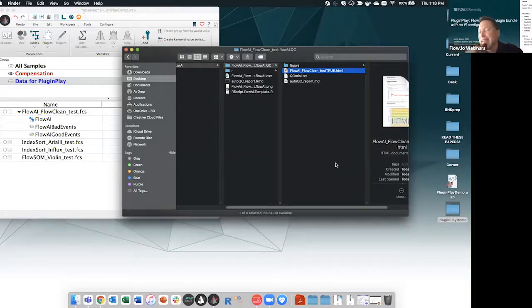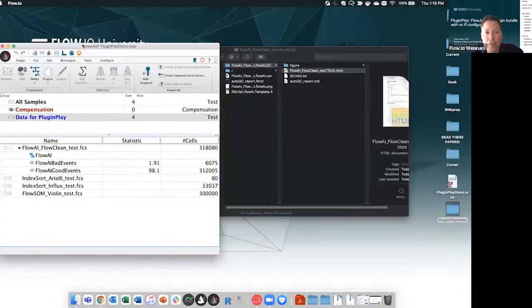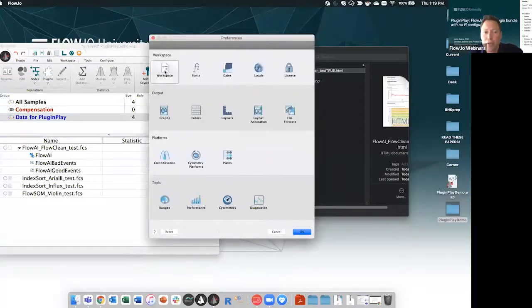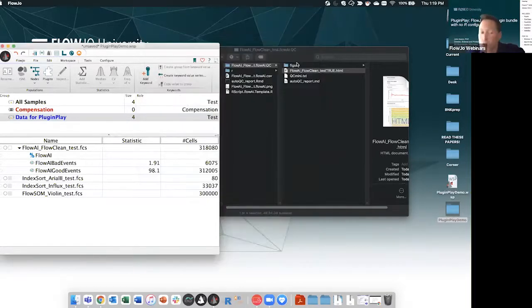If you have the exact same file name, then I suppose it would look the same. And so I'll suggest in FlowJo, you can use basically any keyword as the file name. It's just done by using the heart up here, workspace. You could also use keyword combos. So if you have, let's say, A1, A2, A3, which are going to be pretty consistent, you could add in the date as one of the keywords that get used as part of the name, and thus create a unique name that will allow you to separate and then sort. Good question. I had not actually thought of that one.